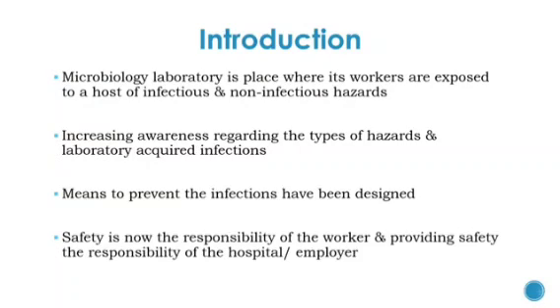Introduction. Microbiology laboratory is a place where its workers are exposed to a host of infectious and non-infectious hazards. There is an increasing awareness regarding the types of hazards and laboratory-acquired infections. Different means to prevent these infections are also being designed. Safety is now the responsibility of the worker, and providing safety the responsibility of the hospital or employer.